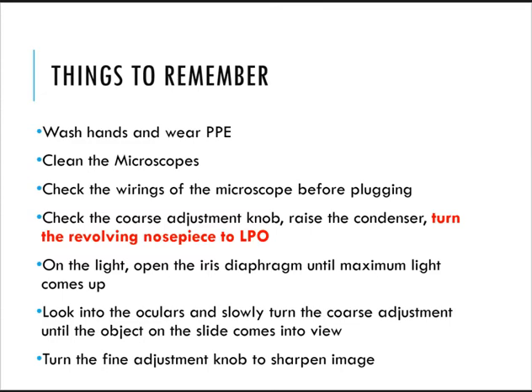So basically, just additional lab safety tips for handling and caring for your microscope. So we have wash your hands and wear PPE, of course. We already established this during our first lessons. Okay, and then we have to clean your microscope. Check the wirings before plugging. What is recommended is your three-prong plugs, right?